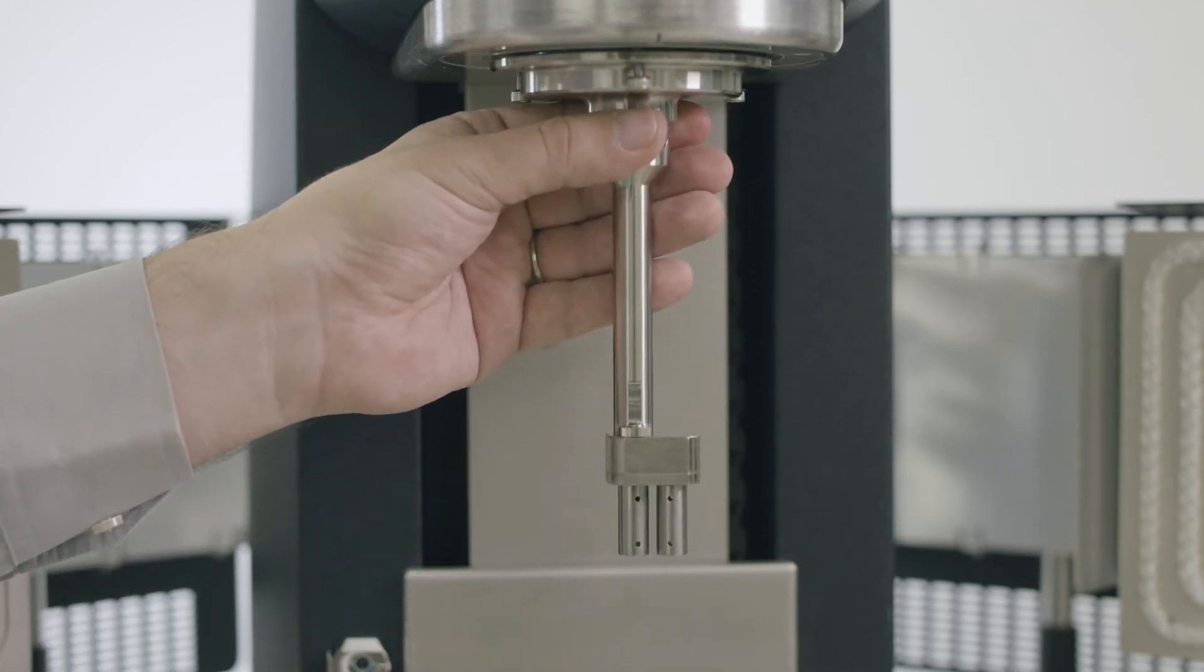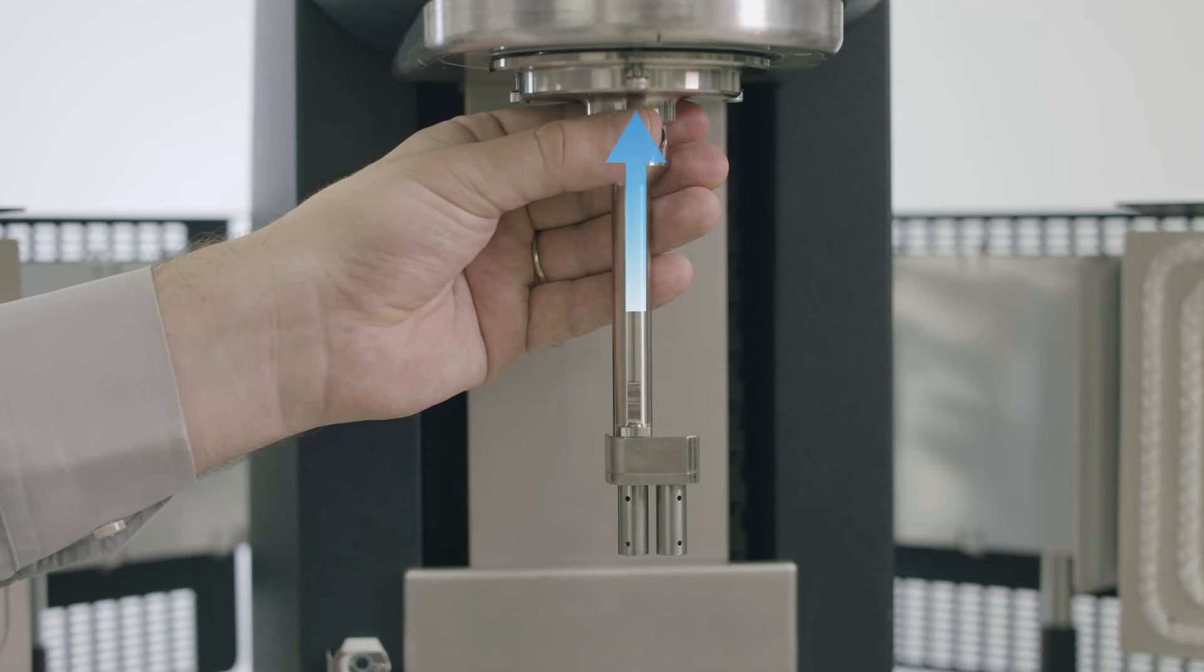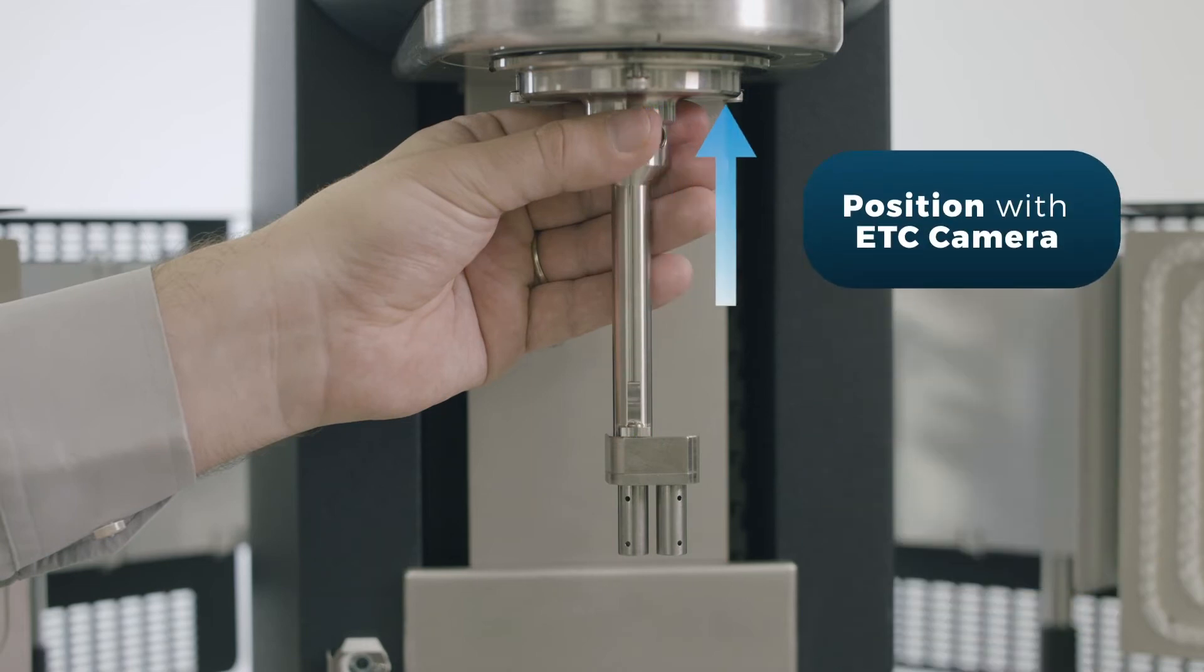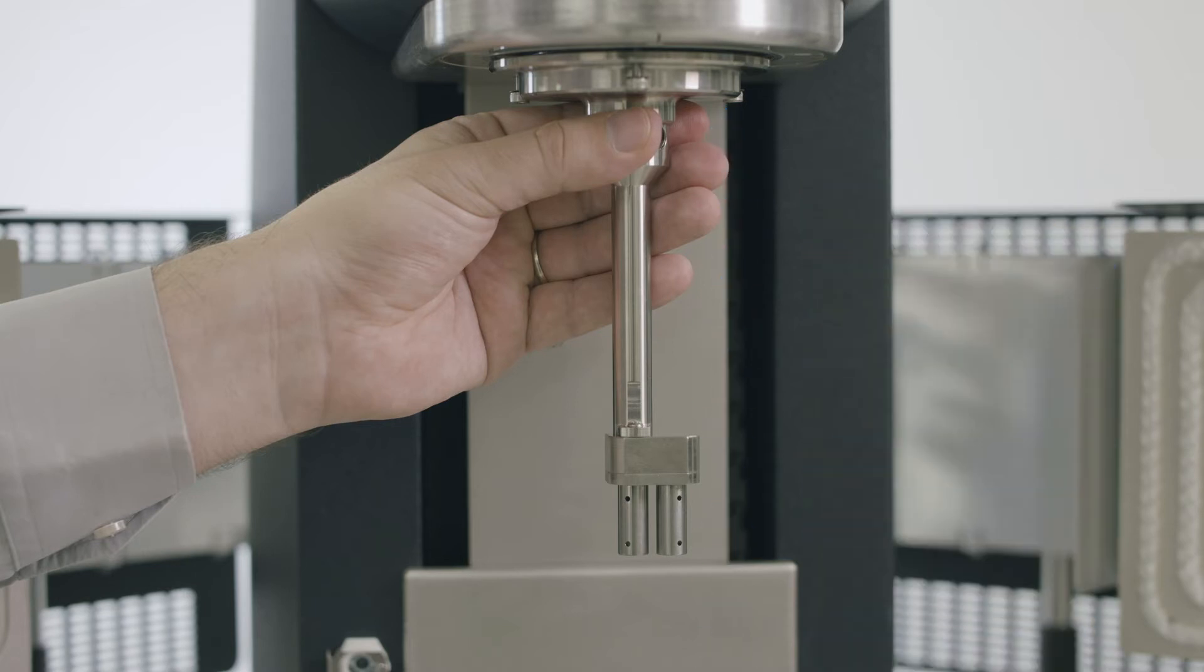The mark on the EVA assembly can be lined up with a mark on the front of the rheometer if not using the ETC camera. If the ETC camera will be used, rotate the geometry so that the mark is facing the back right of the instrument. This will ensure that the sample faces the camera.